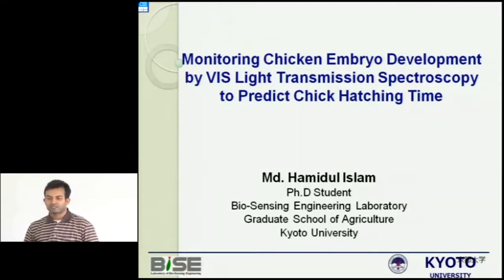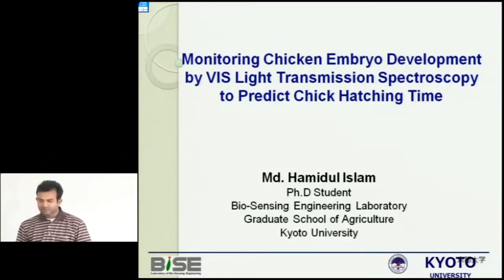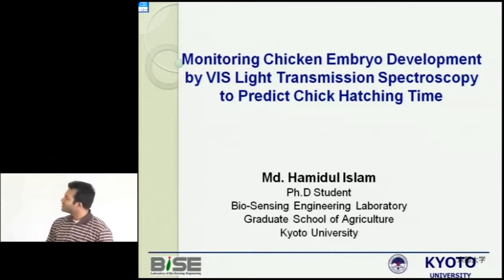Today's presentation topic is monitoring chicken embryo development by visible light transmission spectroscopy to predict chick hatching time.